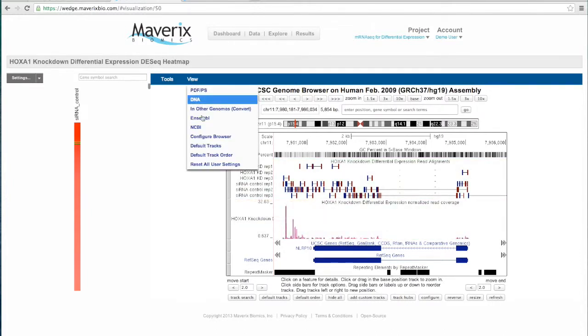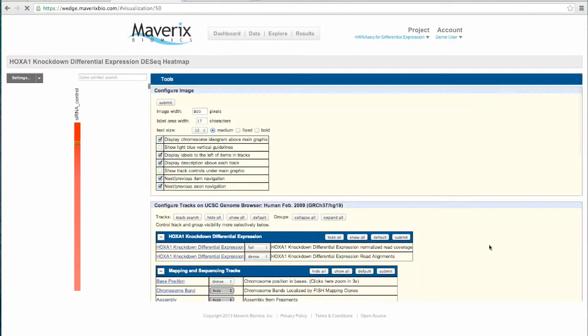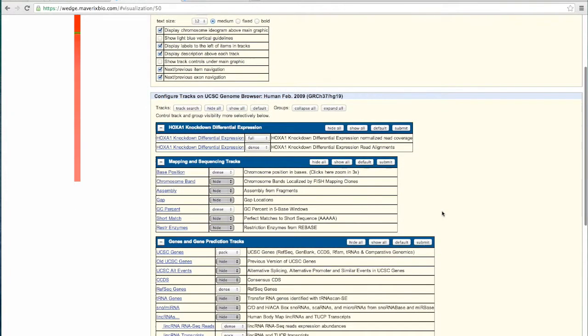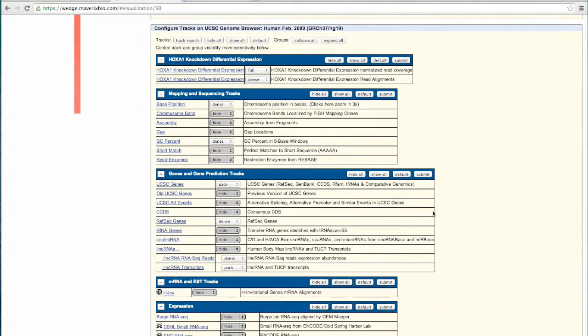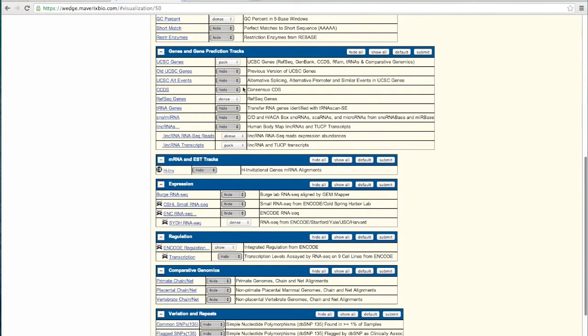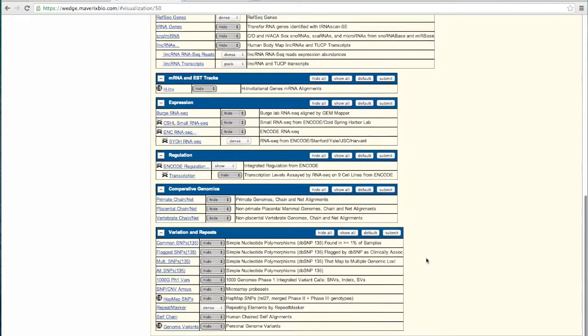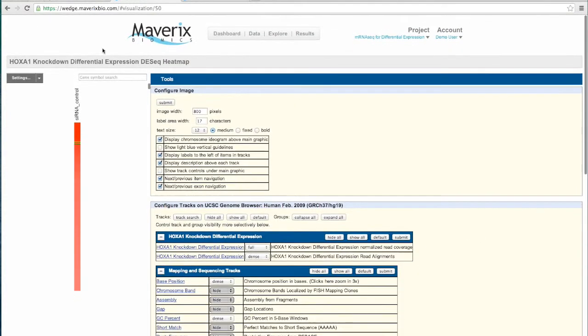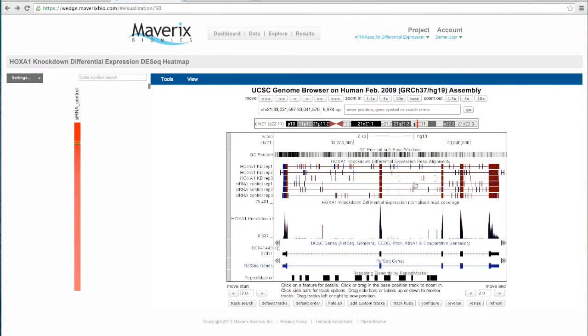And you can configure this just as you would on the public site by adding additional public data sets and tracks. And you can configure the density of any of the tracks as well as all of the other different configurations that you have available to you for the UCSC genome browser. So in this case, you could add some additional genome browser tracks. As I said, you can change the density so that the configuration in terms of viewing those reads, these tracks, excuse me. And then you can just hit resubmit and then add anything that you would be able to see, any of those additional data sets here in context with your private data that you had just run within the tool.